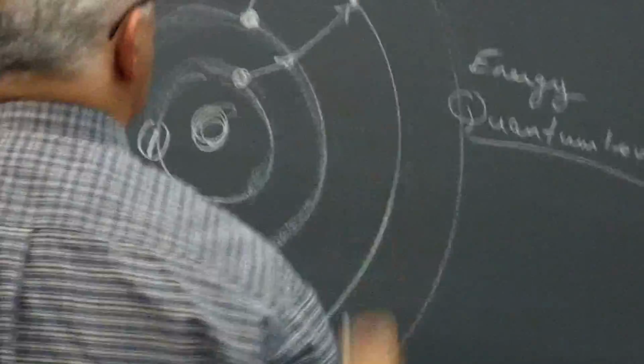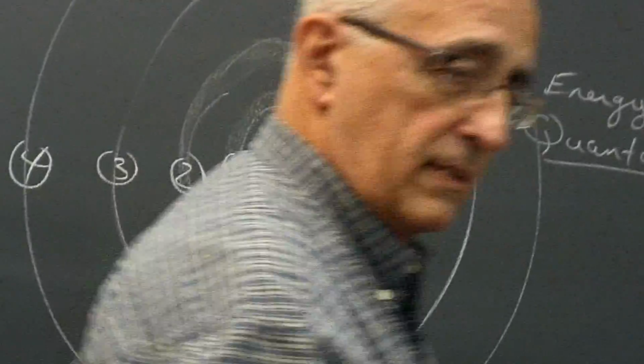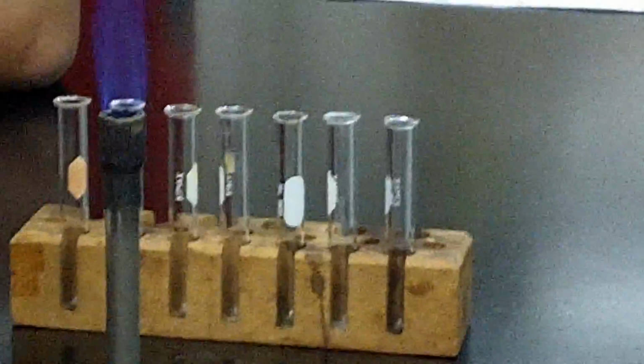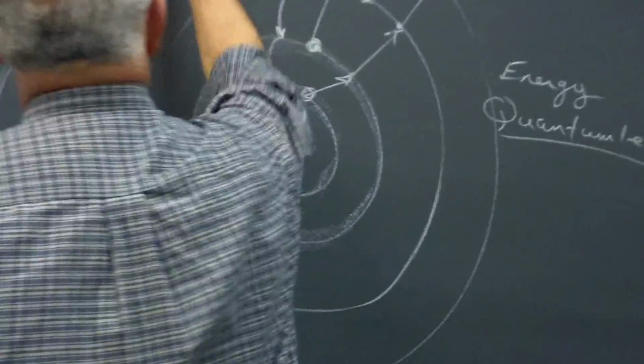Okay? So in the excitement of these electrons, they get promoted to a higher level. And that happens instantaneously. They jump to a higher level. And then as I take one of these metal things and I excite it, some electrons are being excited while other electrons are relaxing. And it's in the relaxation of the electrons that they come back down to a lower level. As they come down to a lower level, they emit light.